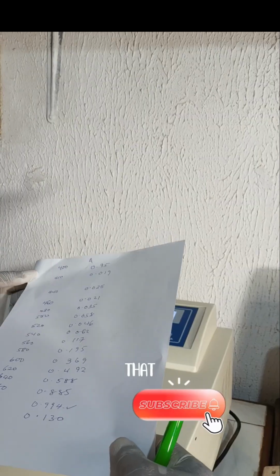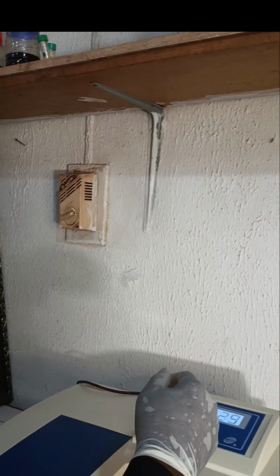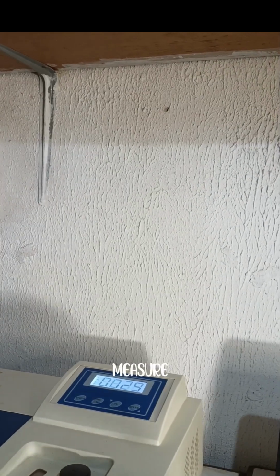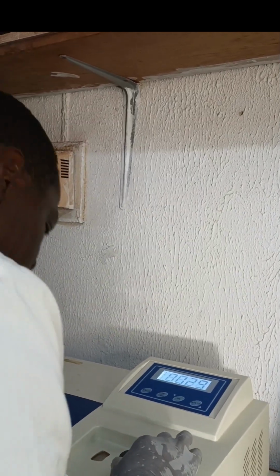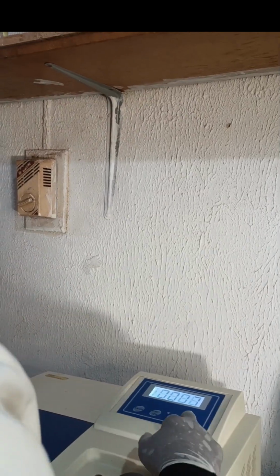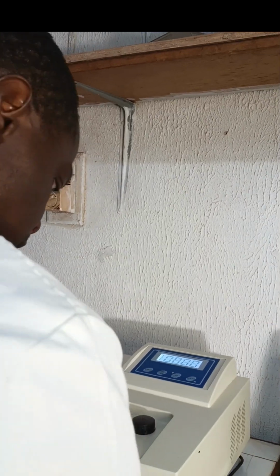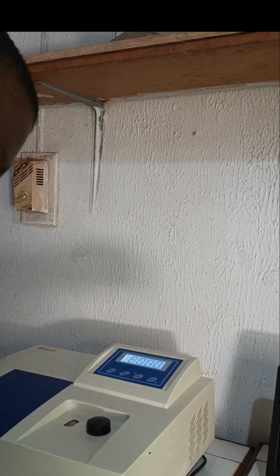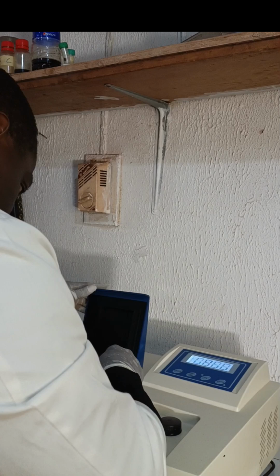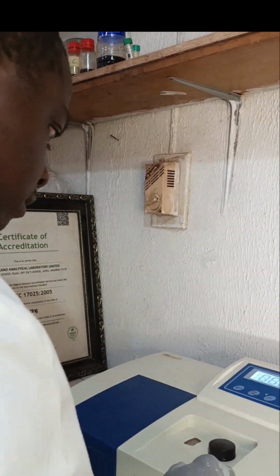Now, before we perform the test, we have to measure the absorbances of our different standards. So already I've added the first standard here, which is 5 ppm.